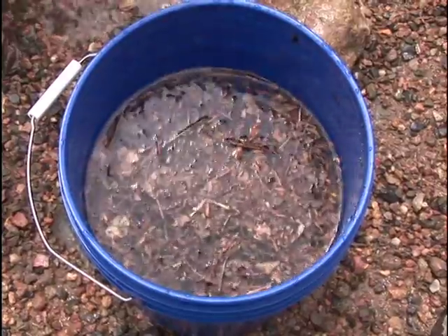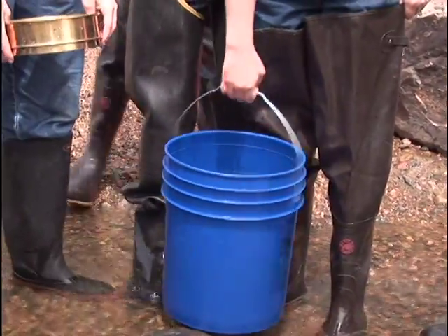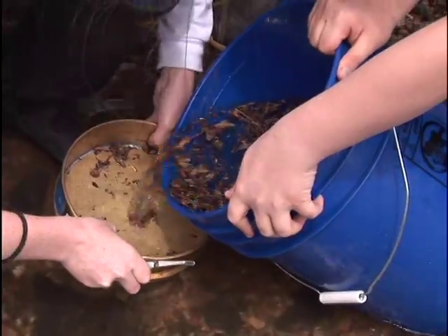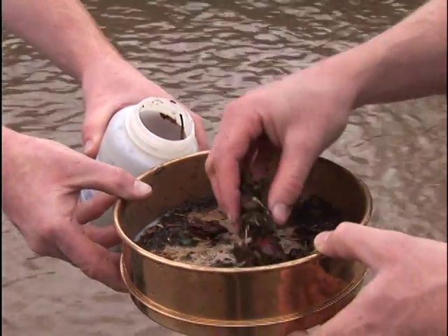With your bucket half full of water and sample material, prepare to swirl. Turn your bucket in this swirling motion to separate the lighter material and bugs from the heavier sediment. The bugs and light debris will float to the top. Swirl for 20 seconds and then pour the sample debris and bugs into the sieve. Carefully place all the organic material and bugs from your sieve into your sample jar.